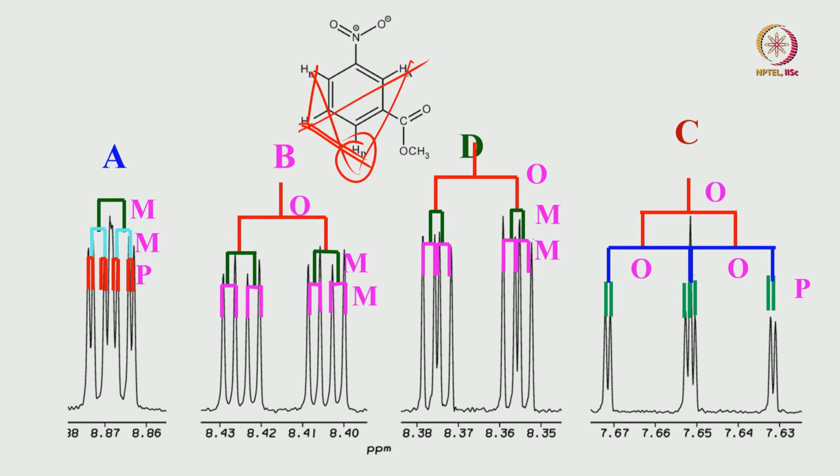Now, we know how we can analyze the spectrum for different protons of the phenyl group. Based on the substitution, we predicted the values and then used a multiplicity pattern and then analyzed it. Very easy.